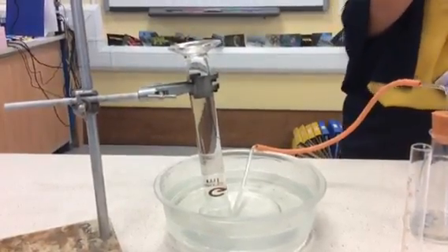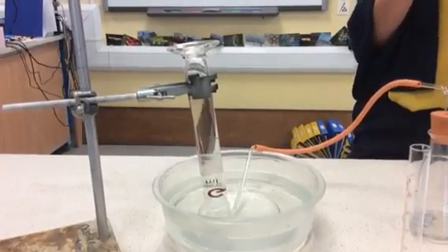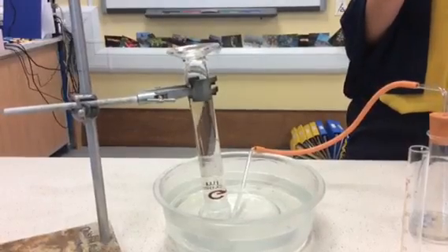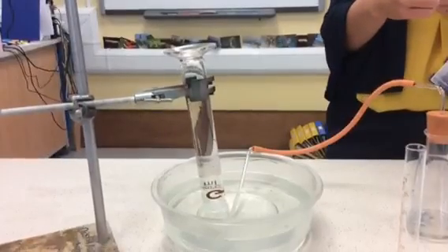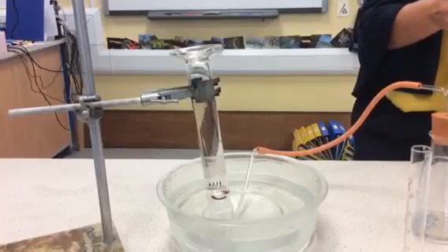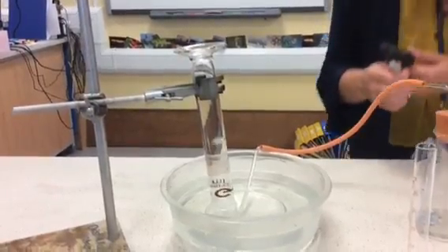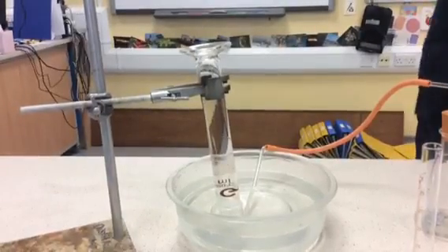Once you've got the word equation, see if you can change that into a formula equation. See if you can remember the formula for sulfuric acid. See if we can write that down, and see if we can work out the formula of zinc sulfate. That's a little bit more tricky. You'll need to see if you can remember the formula of the sulfate ion. Okay, if you can't remember the formula of the sulfate ion, it's SO4 with a 2- charge. Okay, next 30 seconds, we're now on 21 cubic centimetres.